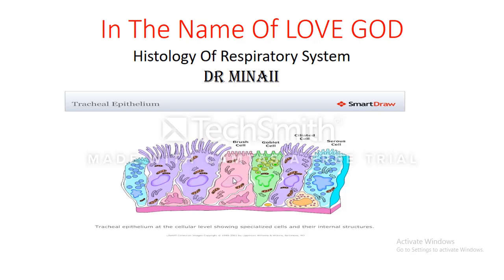This is a brush cell. And this goblet cell. And this ciliated cell. And this small granular cell. Tight cell in epithelial respiratory. Very beautiful picture.